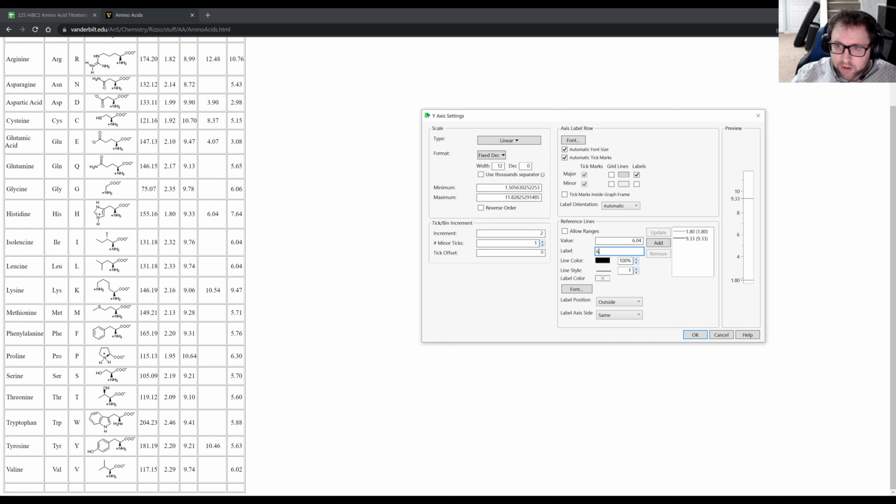And then we're using 0.05 molar NaOH to get back. So if we add like 10 drops of HCl, we need theoretically 200 equivalent size drops of your titrant to get back because our titrant is 20 times less concentrated than our acid that we're using.